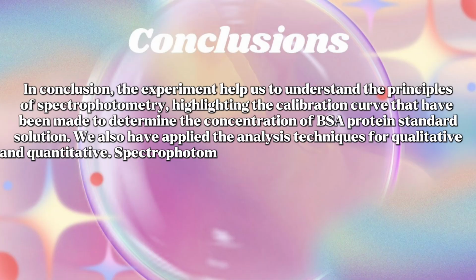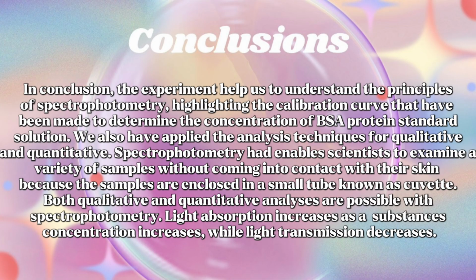In conclusion, the experiment helped us to understand the principle of spectrophotometry, highlighting the calibration curve that had been made to determine the concentration of BSA protein standard solution. We also have applied the analysis technique for qualitative and quantitative.